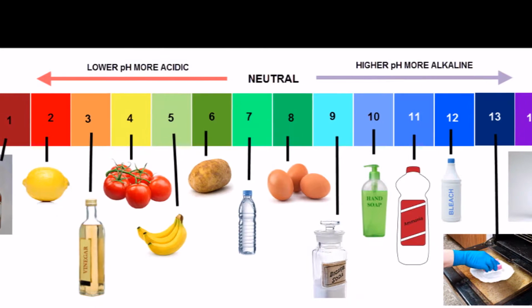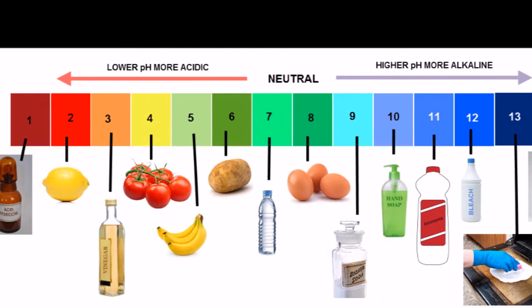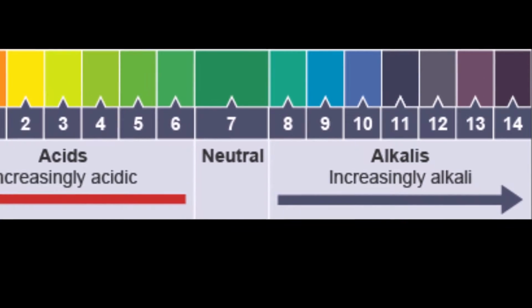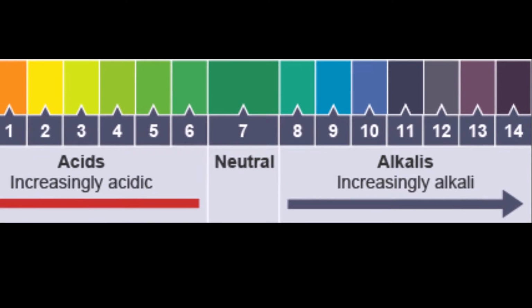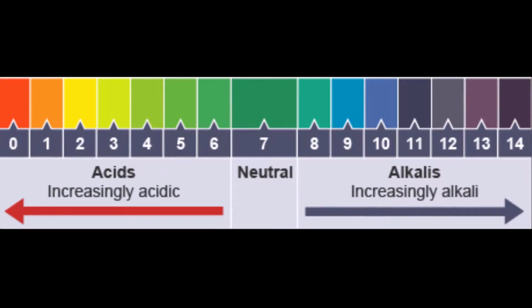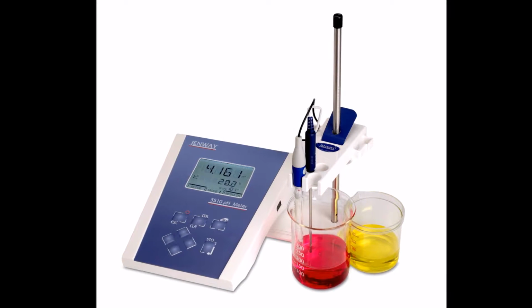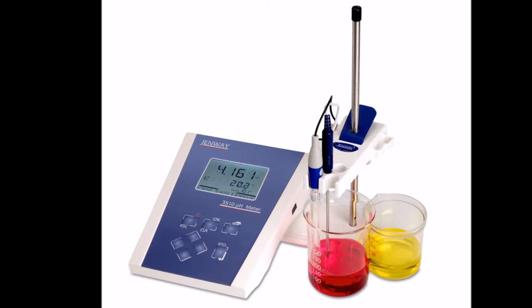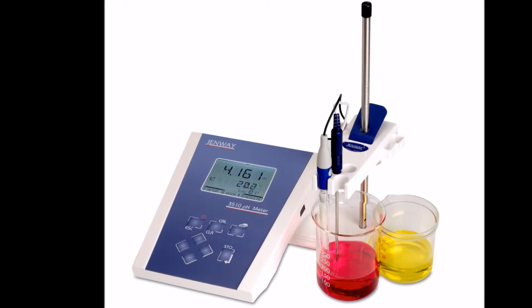The color of a neutral solution is green. The one for acid goes from red to a yellowish orange, while the bases go from different tones of blue to purple. But when you use the pH meter, it gives you a number between 0 and 14. This experiment contributes to science because it helps you to see what's easier or more effective, the pH meter or the universal indicator.